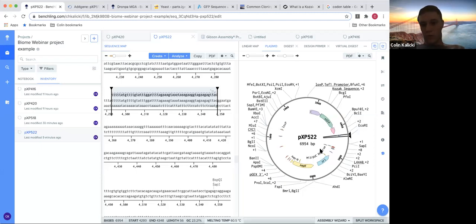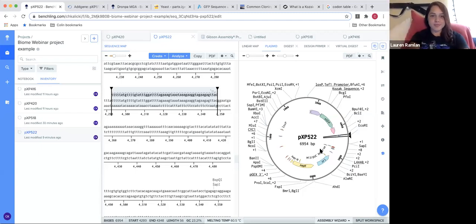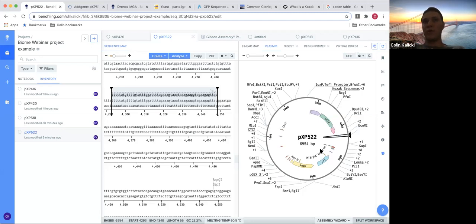So cool, we got this, yay. Now, a fun thing: me and Lauren are going to probably use something like this in the future to actually make bread. So look out for that. We're going to use baker's yeast and transform it to make glowing bread and other things too. I always forget the name of the banana thing. Is it isoamyl acetate? I got it. Isoamyl acetate, that's the banana flavoring in Laffy Taffy. Other things too, we thought about making it more buttery. Since we're in California, we thought about adding THC to it.